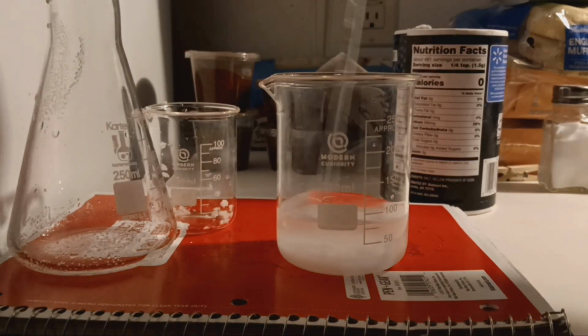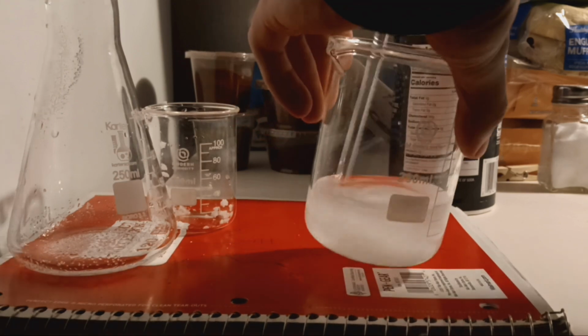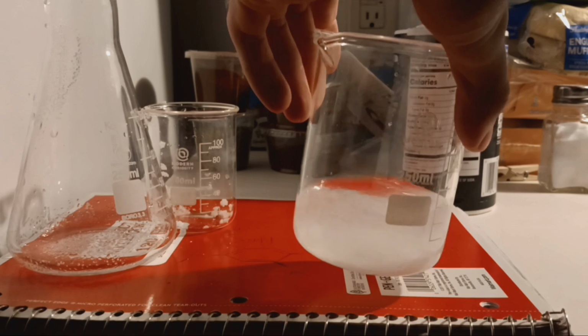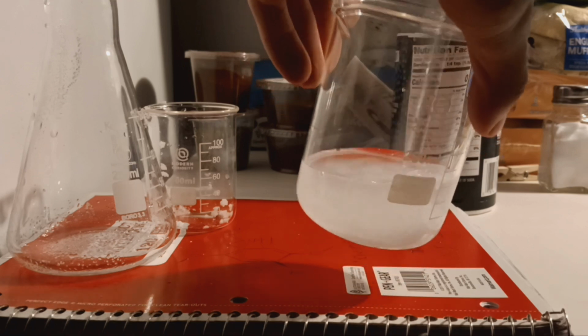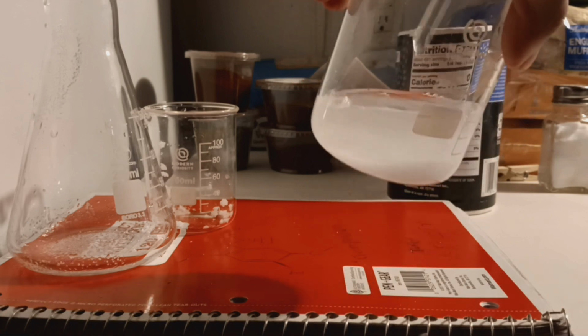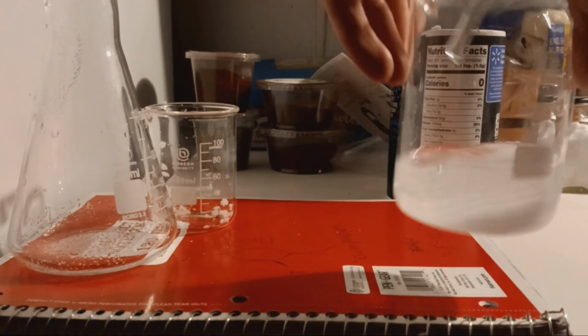There are two reasons for the salt not dissolving. First reason is that we had too much salt in the water. This would result in some of the salt not being able to fully dissolve. The other possibility is that my water that was hot was not hot enough. So to solve this, I went to very drastic measures. I tested if my glassware could function in a microwave.